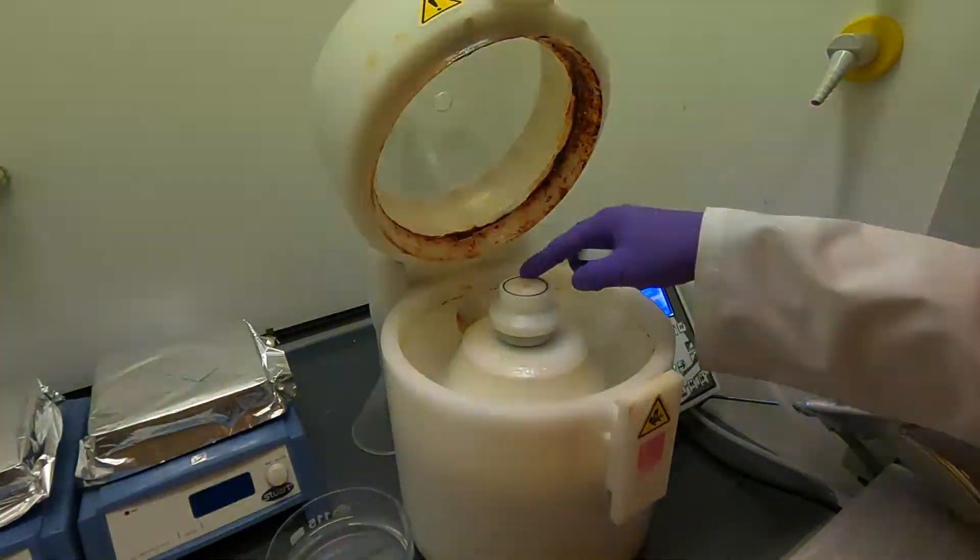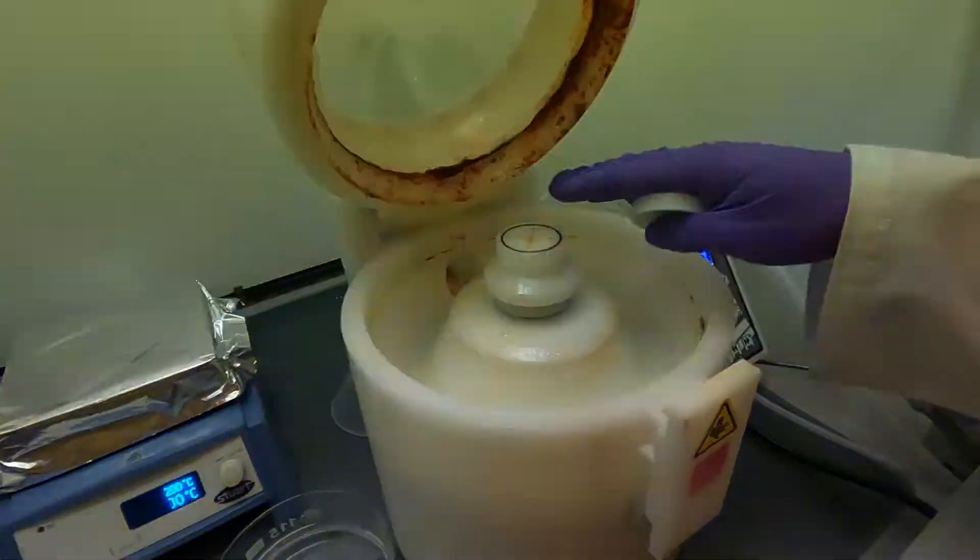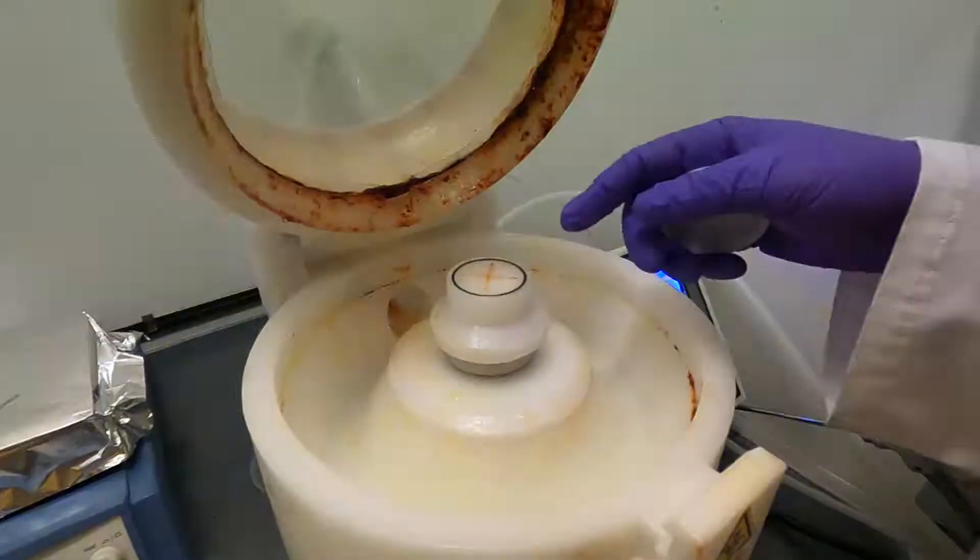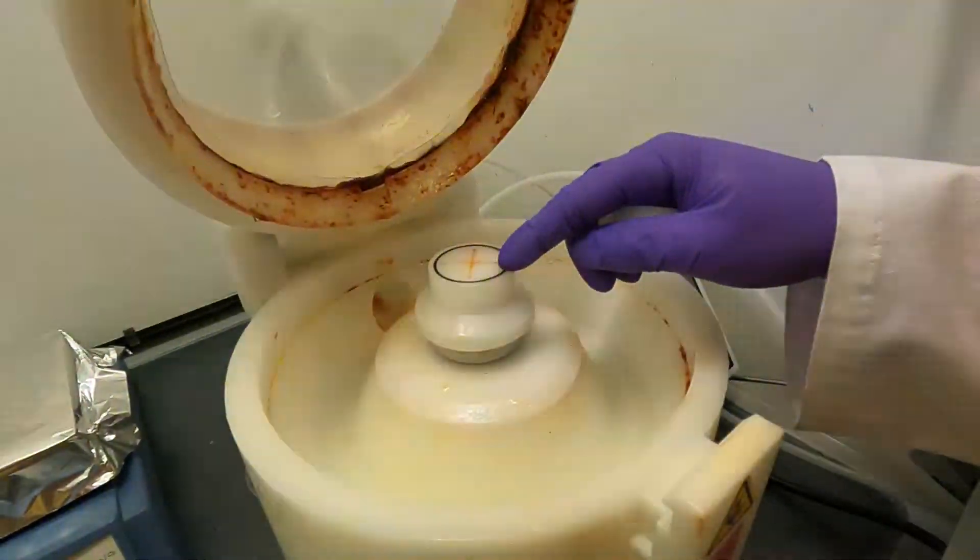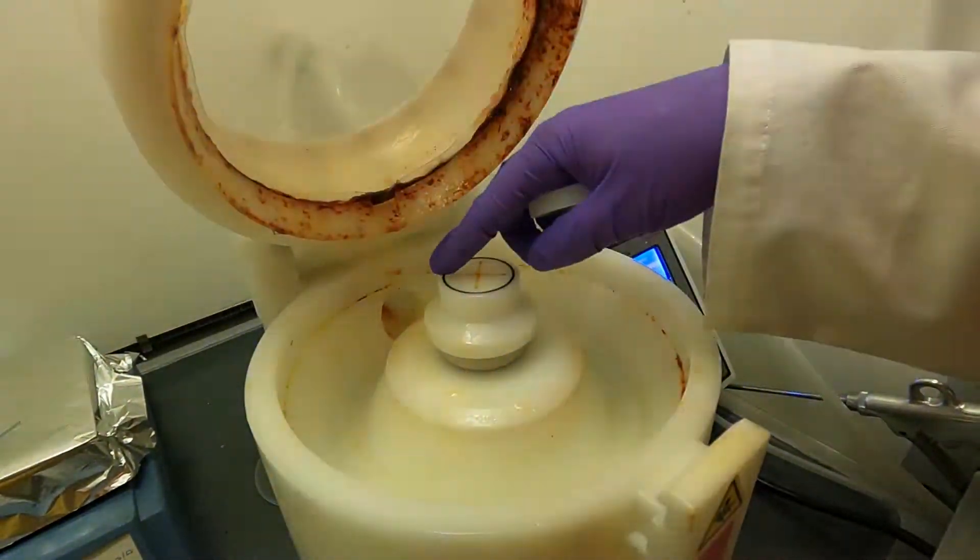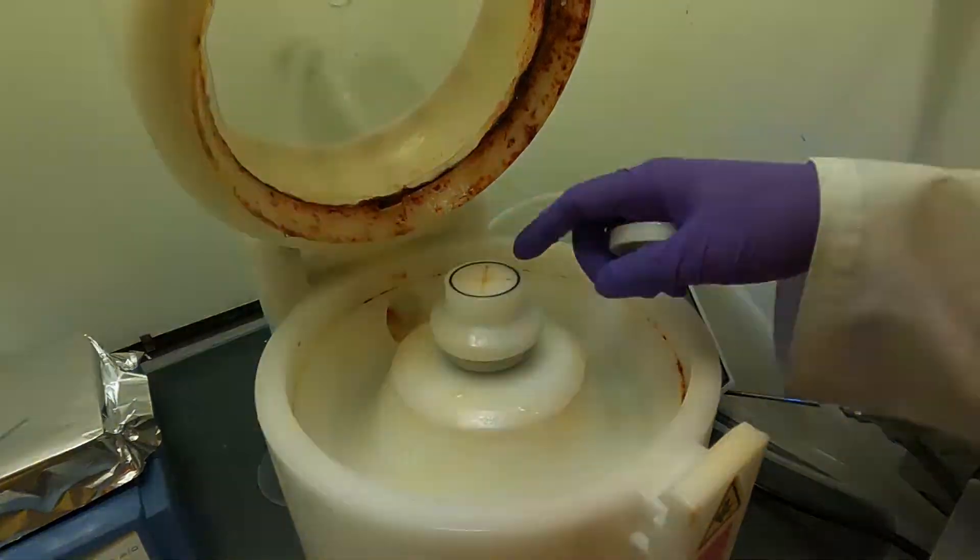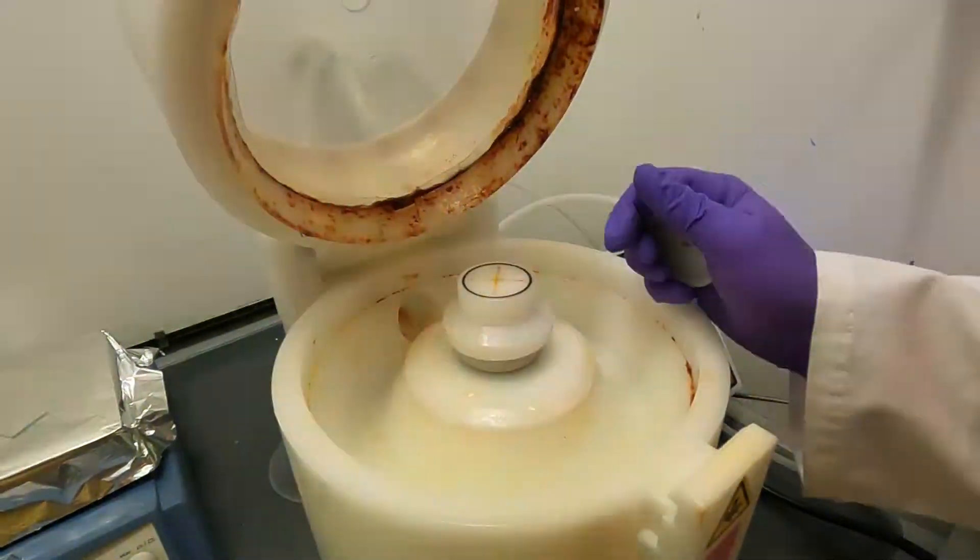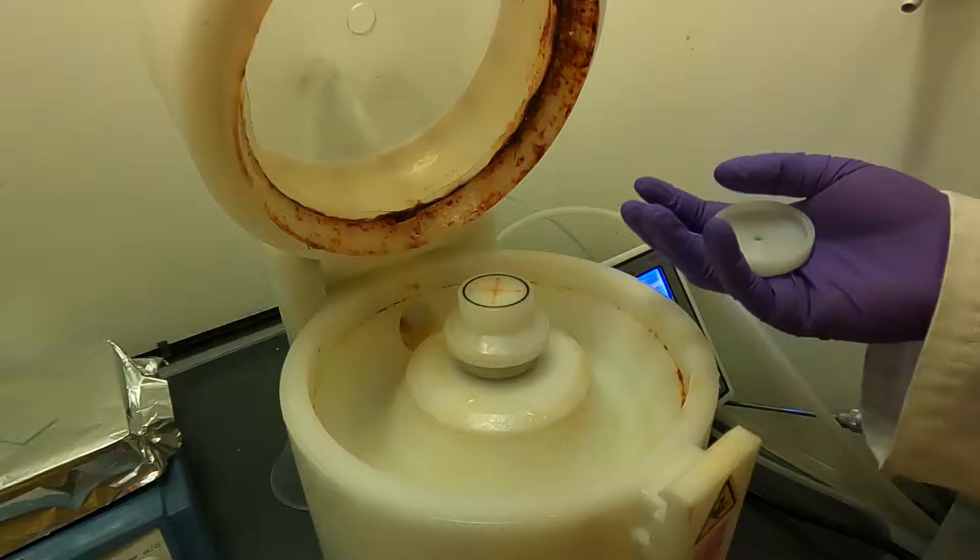You see this rubber ring, this makes a seal with the sample. So the sample is quite big, for example a silicon wafer or a glass wafer, you can put it directly on top of this chuck and this rubber ring will make contact with the sample and it will seal it in place.